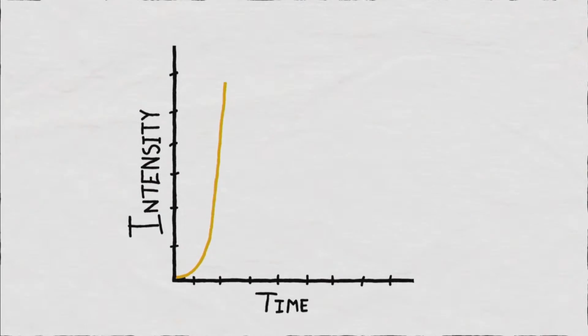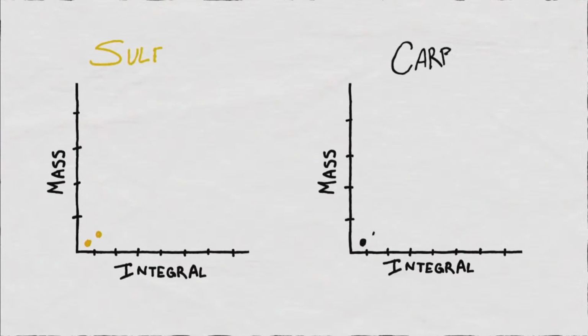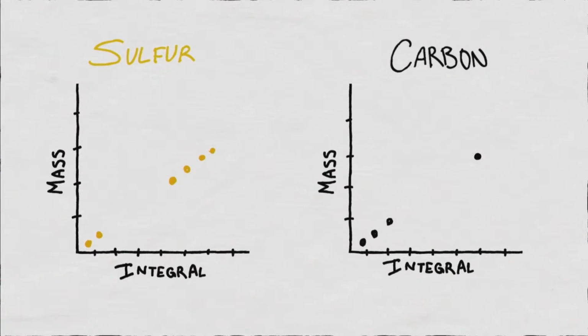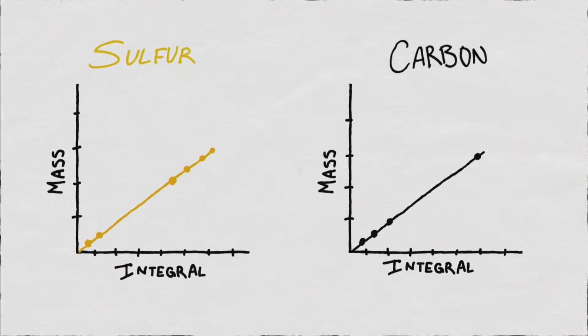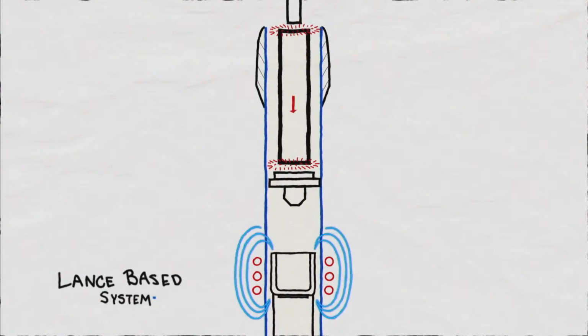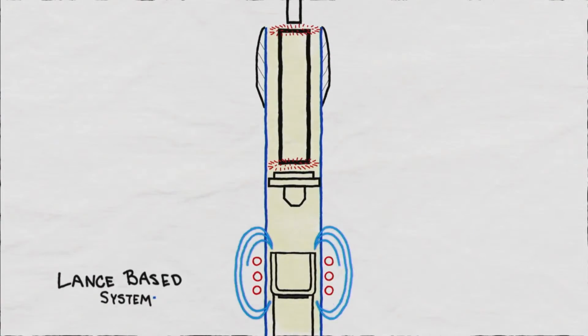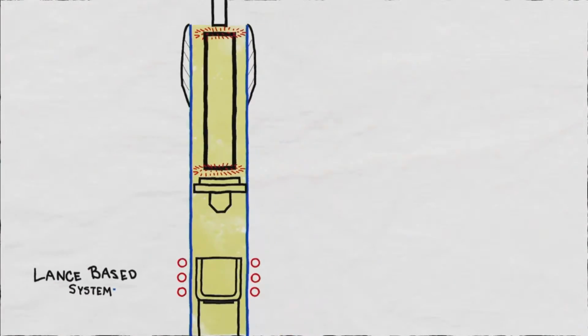Signals of CO2 and SO2 are recorded over time and integrated. Peak areas are directly related to the mass of CO2 and SO2 and are calibrated to the mass of carbon and sulfur in the sample. A fast and complete combustion is also vigorous and creates dust. Dust handling is important for analytical results, safety, and component lifetime.